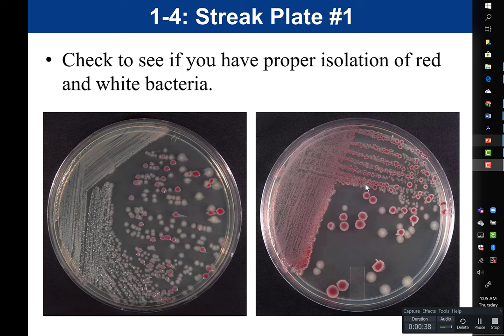Looking at one of the plates more critically: the streaks got close together, and the streaks also look a little bit broad. That means the loop angle was likely a little too flat — a flat loop angle gives broad streaks. You want your streaks to be much thinner. One plate here has thinner streaks, while the other has more of the broad streaks. But both would still be considered successful streak plates because isolation was achieved.